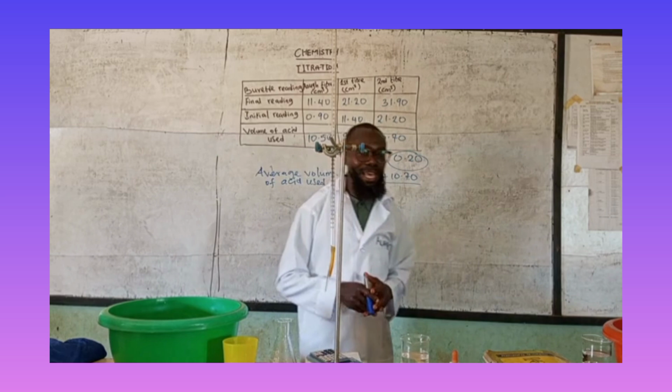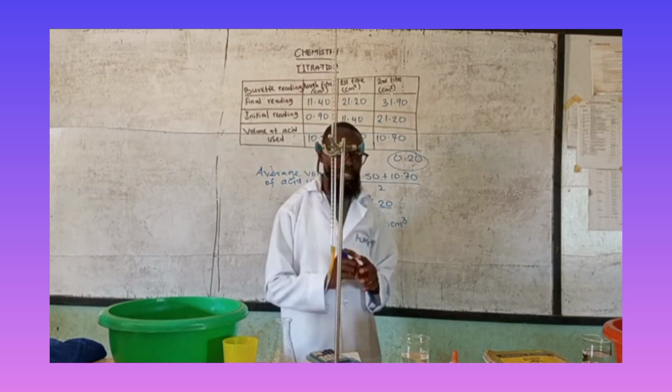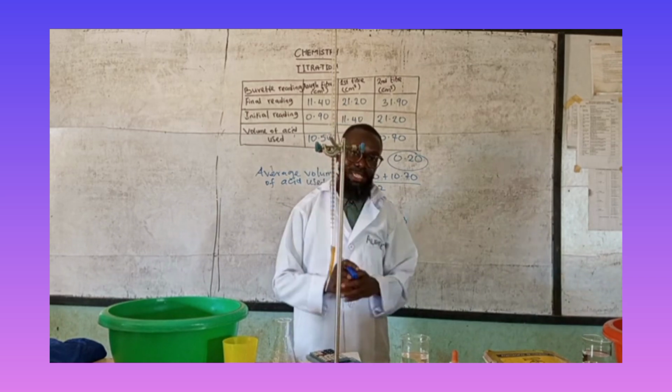So this is the end of our titration class. So for you to titrate, these are the steps you are going to take during your titration.